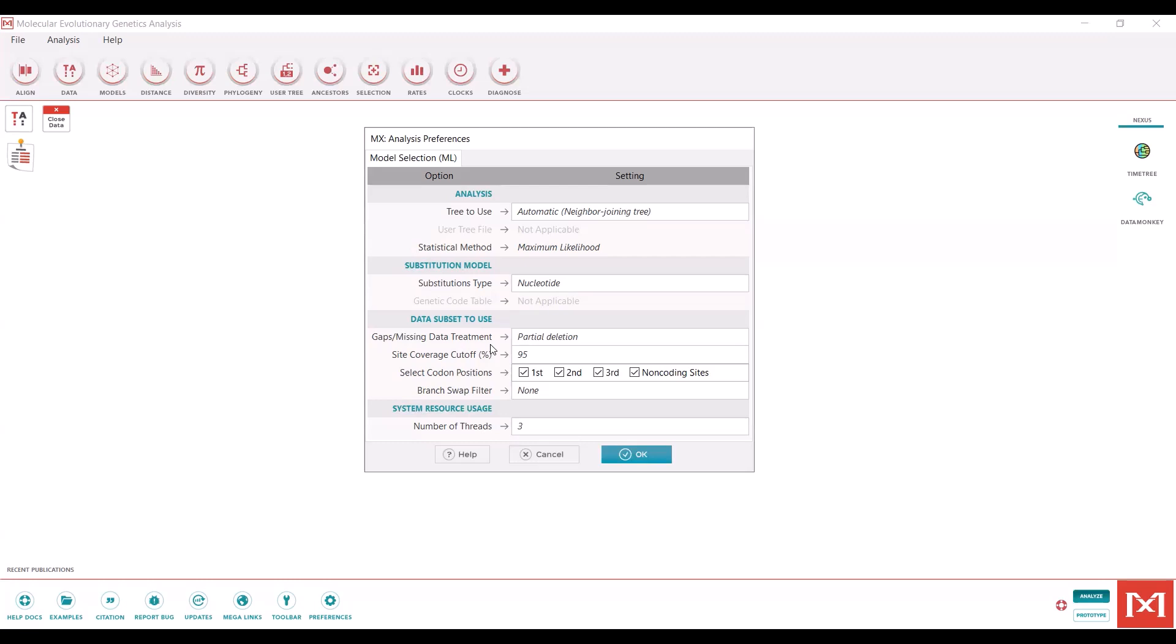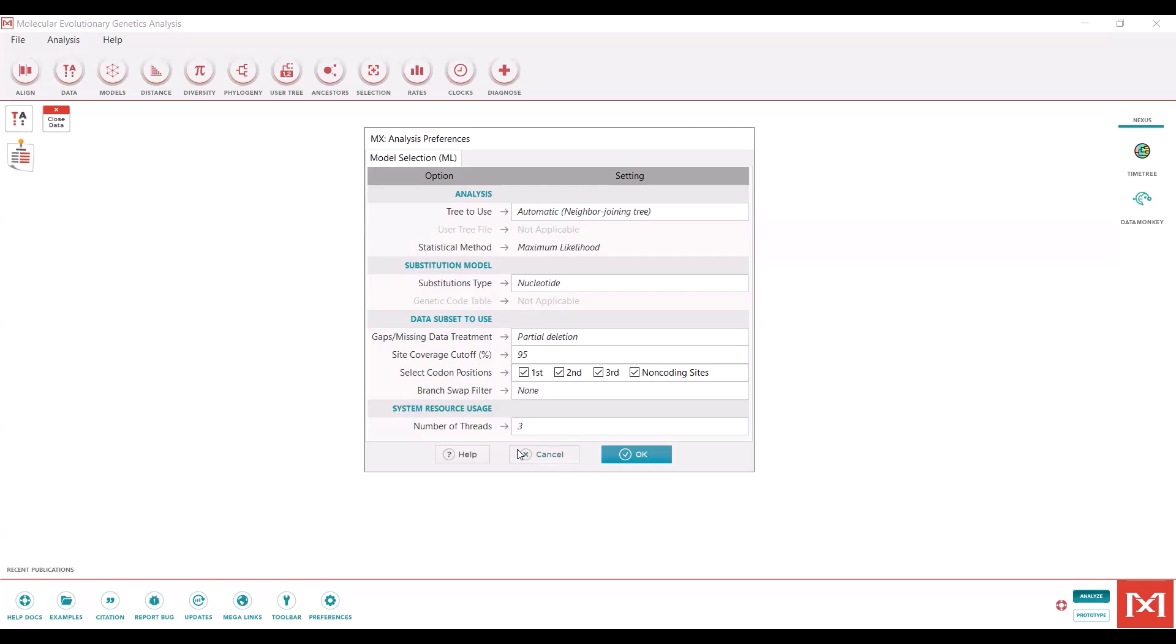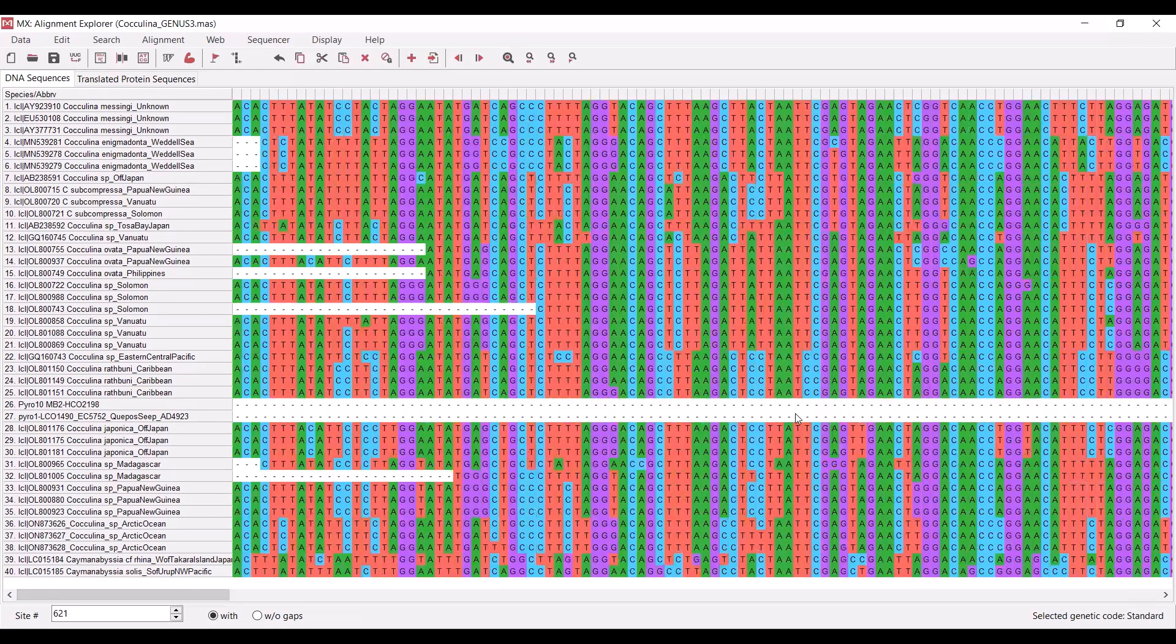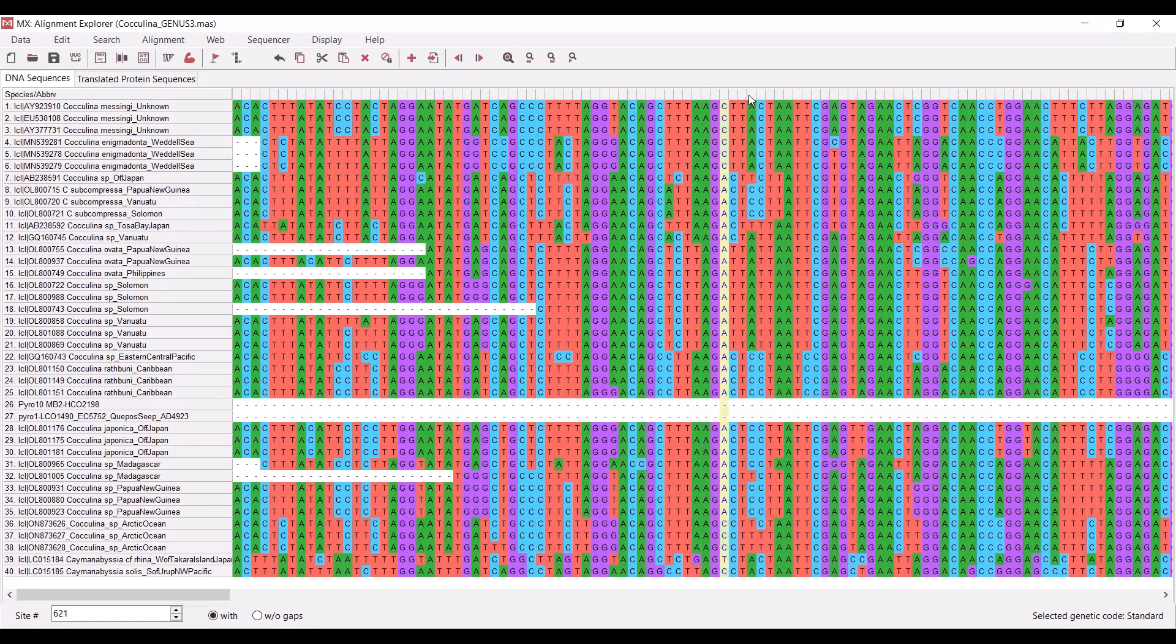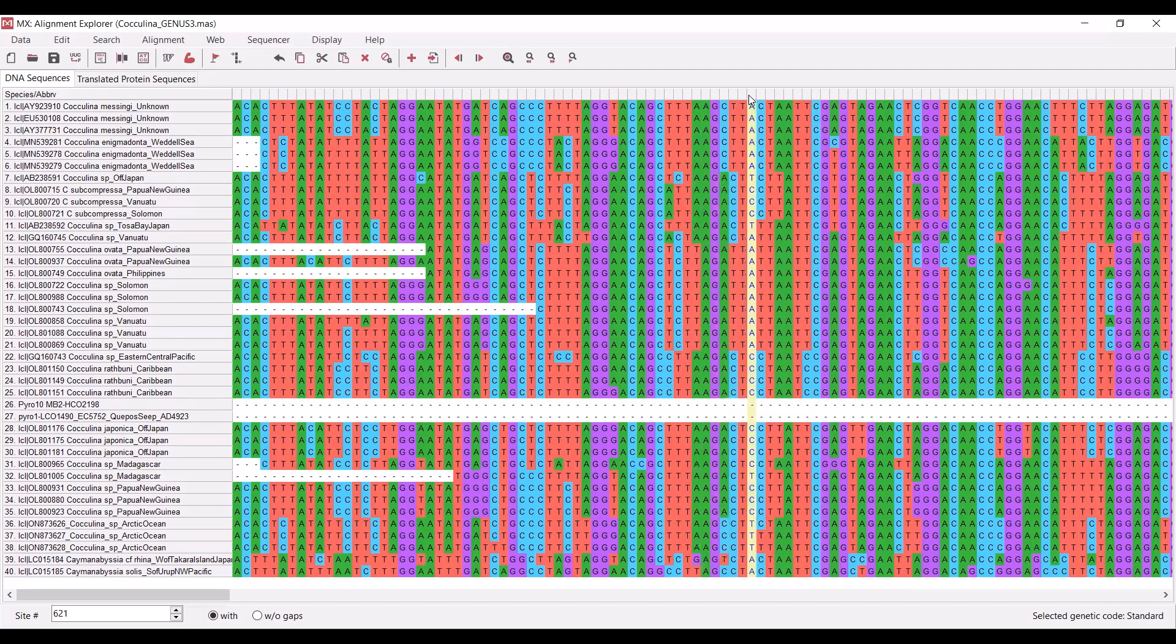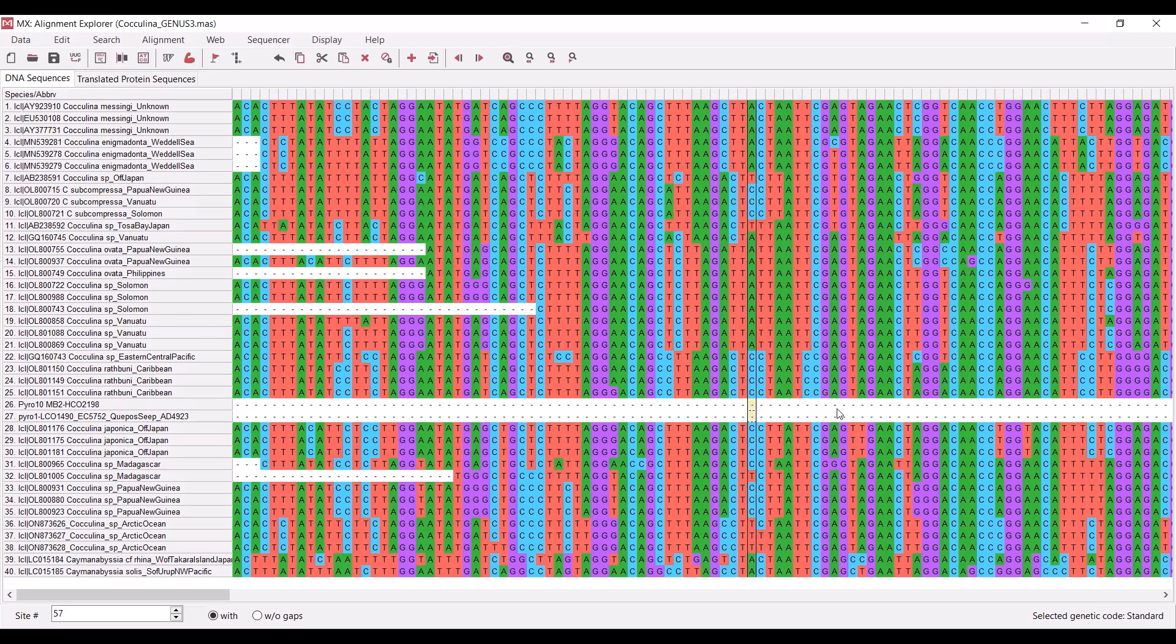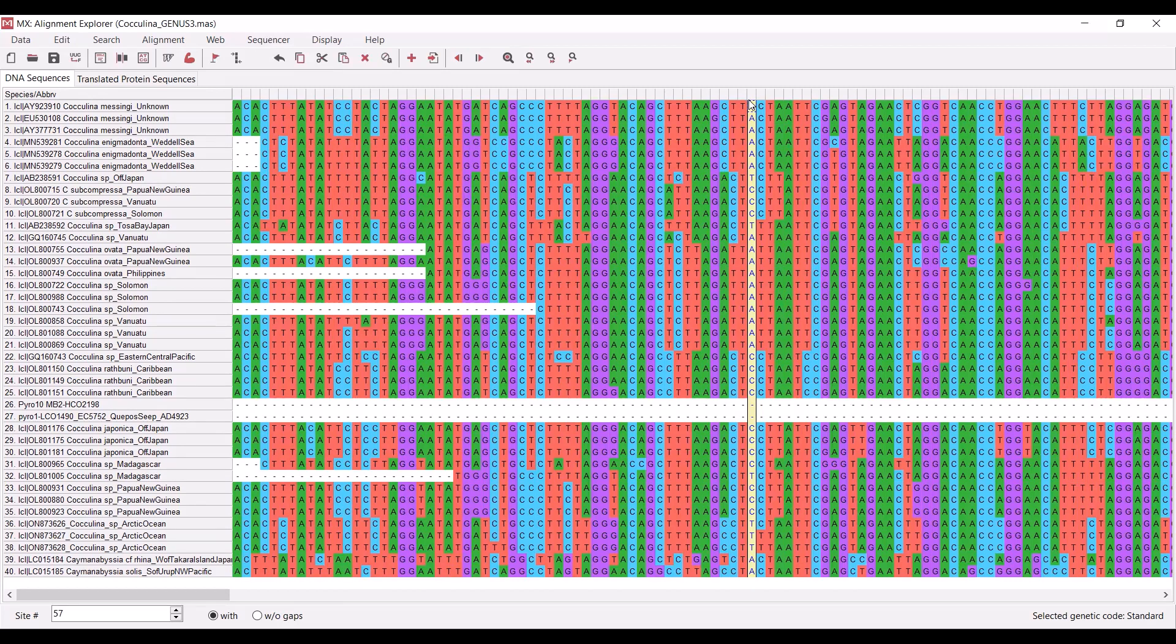The partial deletion option allows you to adjust the threshold for how many missing bases can be present in the data set at a single base position. So when we say a 95% cutoff, what that means is for each one of these base positions, there needs to be a base specified for at least 95% of the sequences in the alignment. For instance, we have these two missing bases at this base position. That is going to be above the 95% threshold, and so this base position will be incorporated into our phylogeny given a 95% cutoff.